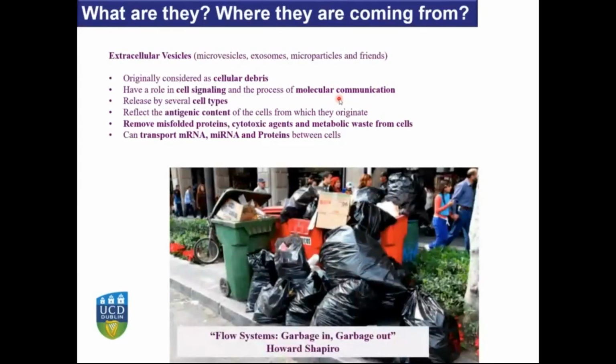Usually, we didn't pay attention to the EVs because they were considered garbage, the junk that we were usually gating out. But because of this effect of molecular communication, and because they have been seen to be involved in different diseases, people are paying more attention. When I'm talking about EVs, I usually classify them as garbage, because it's basically garbage. But if we look into the detail, into the garbage, we can find very useful information.